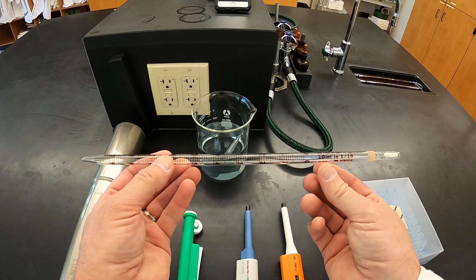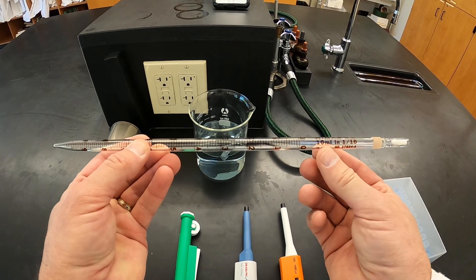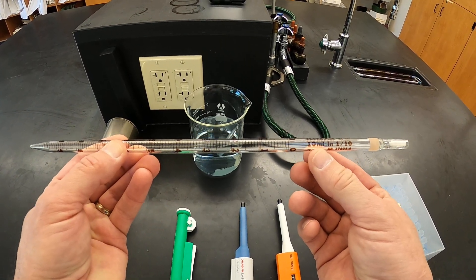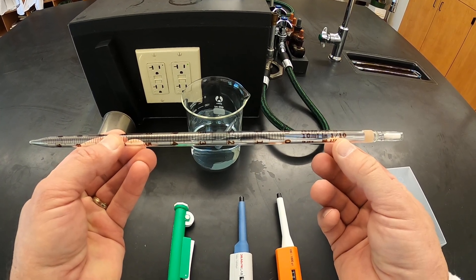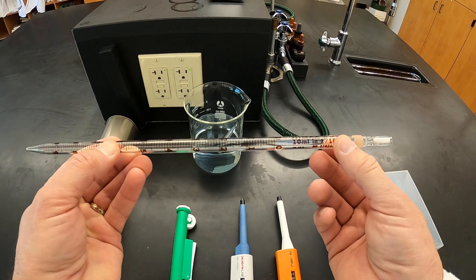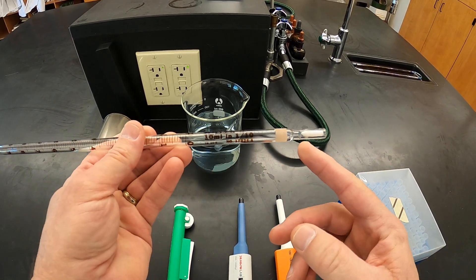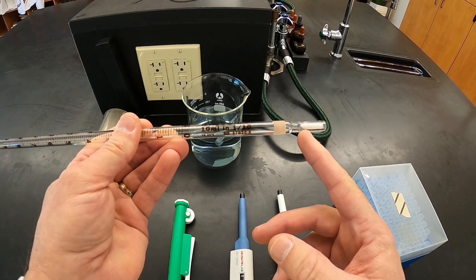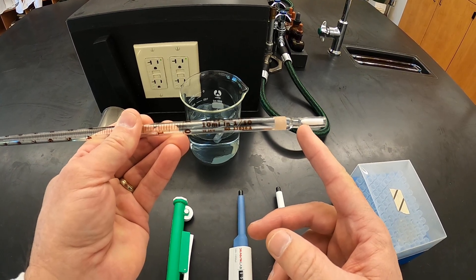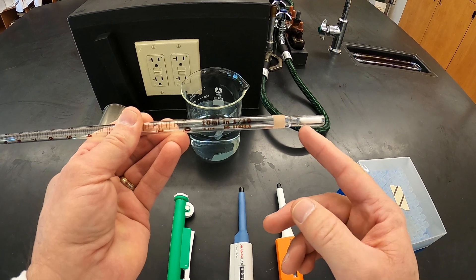On this particular pipette you can read from the label here that it is a 10 milliliter pipette, and that the volumes are accurately measured to one-tenth of a milliliter. Then we'll notice something on here near the top of the pipette there is an etched band. Sometimes these can be colored bands as well, and there could be more than one of them.